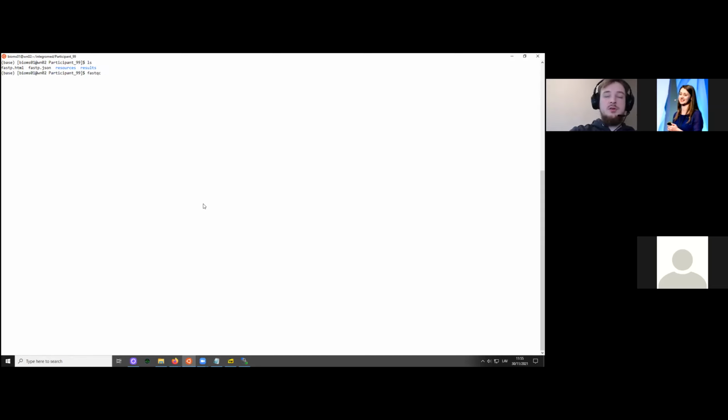So we'll just do FastQC again, but this time as input, we'll type results fastp, and we'll input the trimmed sequencing file. -t 2 for 2 processing cores, and -o for our output. No, I guess I forgot to create a directory first. We should have results 03 fastqc trim. Yes, and now we're going to run the FastQC again.